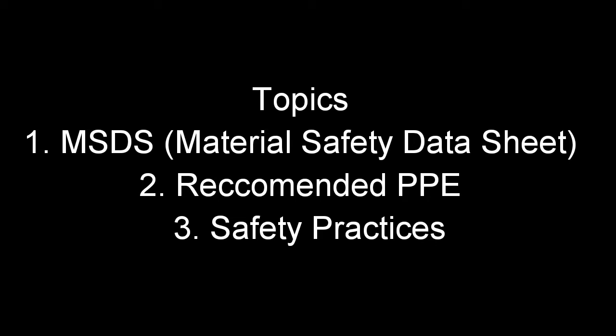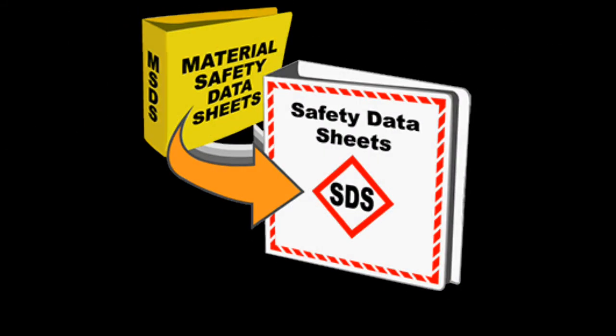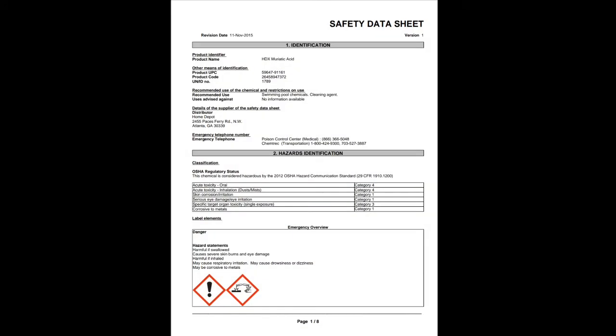Material safety data sheets are important to know and be familiar with, as they provide information about the chemicals that you are using. This is what a safety data sheet looks like — it's very important to be familiar with the information in this document for the chemical you're working with.